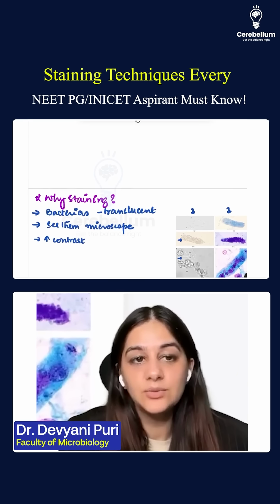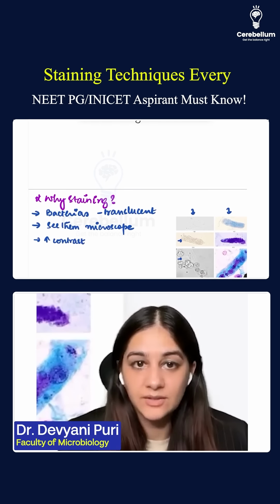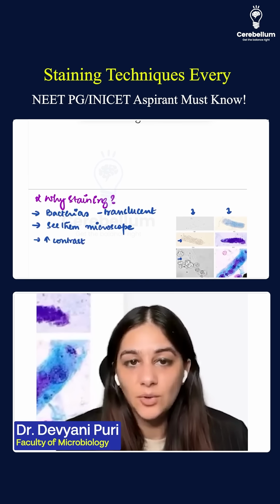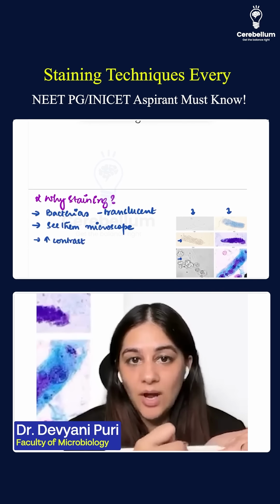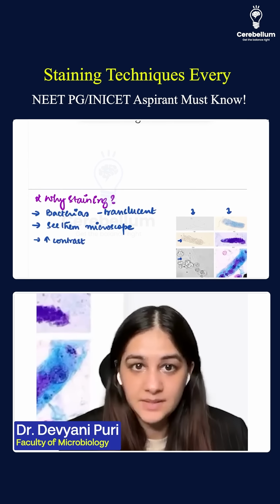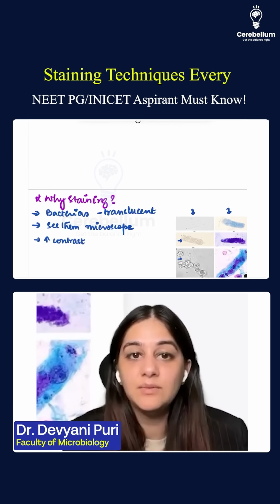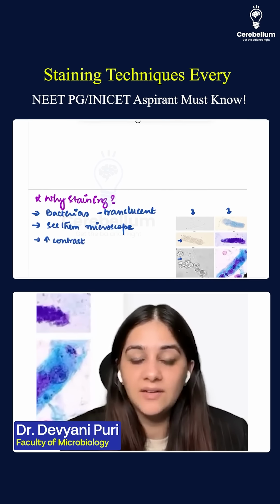Whenever we do the staining, the first thing that we do is prepare a smear. We take the colony and prepare a smear on a slide. Smearing is nothing but taking a colony and making a round colored thing. We can make smears either directly from the samples, or, if we have isolated an organism and want to identify it, from the colony that we have grown on the culture.